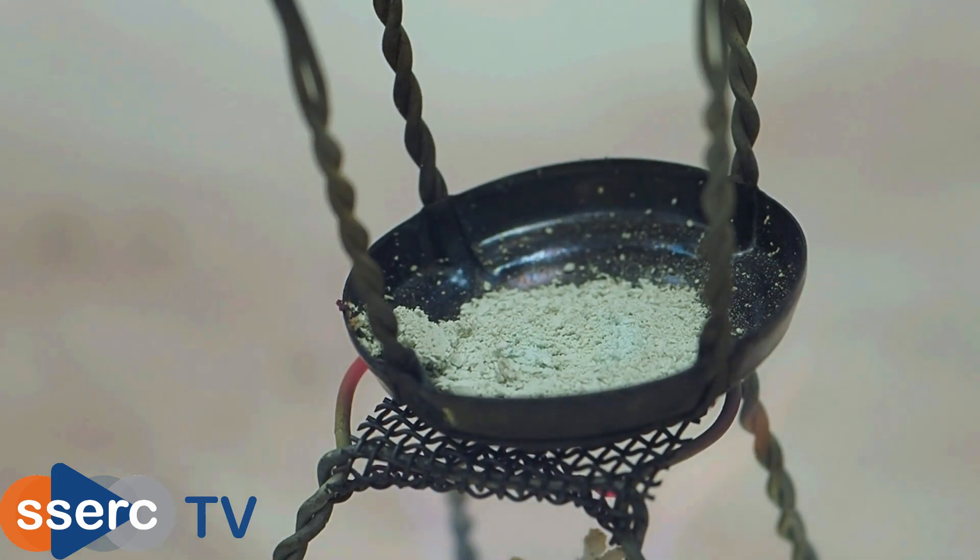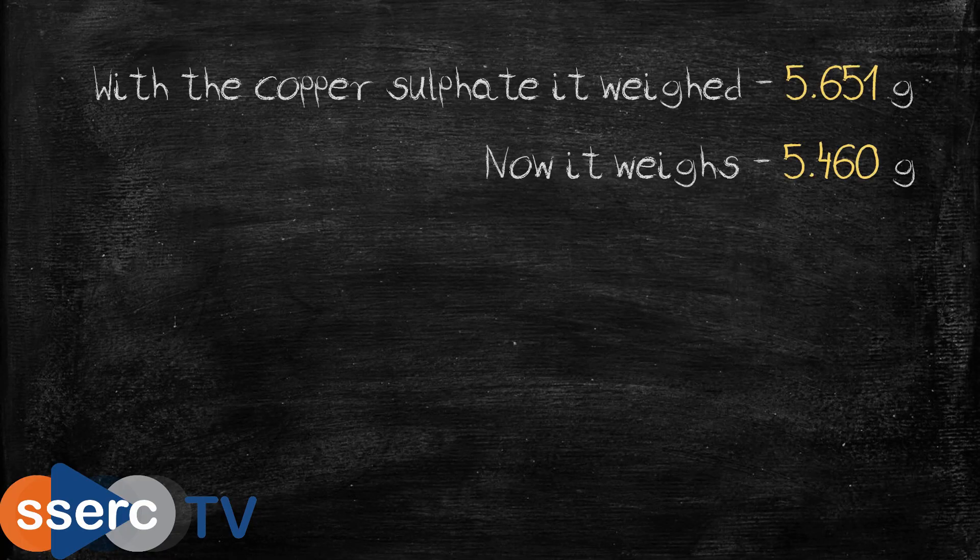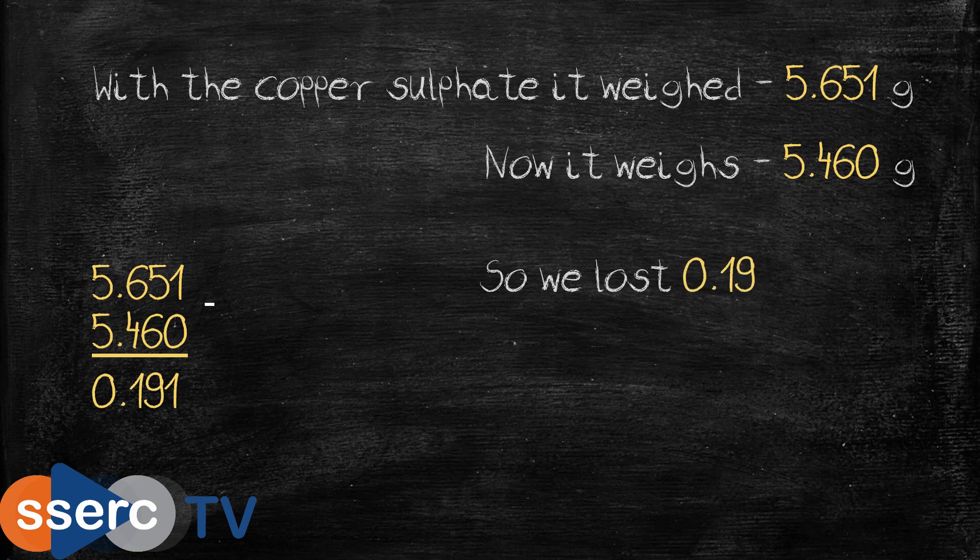Now let your copper sulphate cool and then re-weigh it. You can clearly see that it has lost mass — nearly 0.2 of a gram in this case.